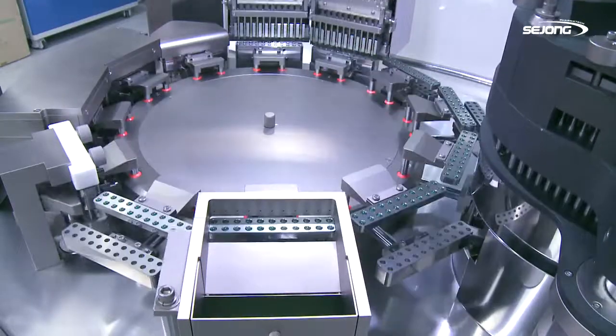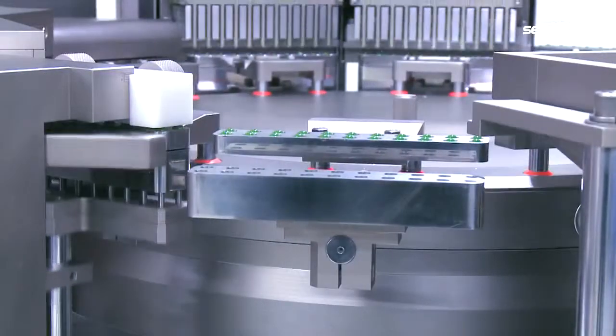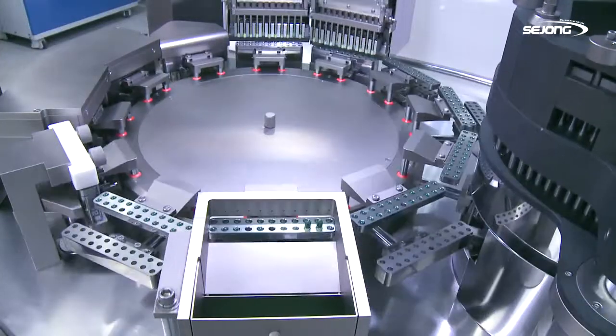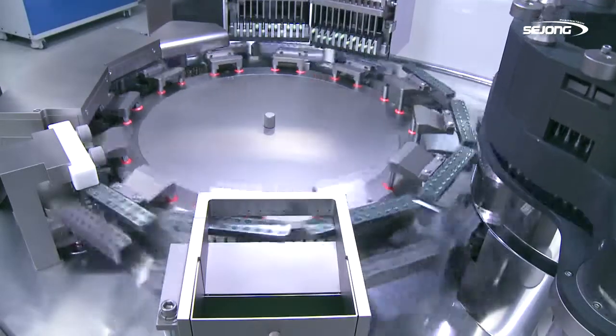We have strengthened a function to accurately discharge, filter and separately store any capsules with a cap and body that are not delivered through the up and down movement of ejection pin and air block.